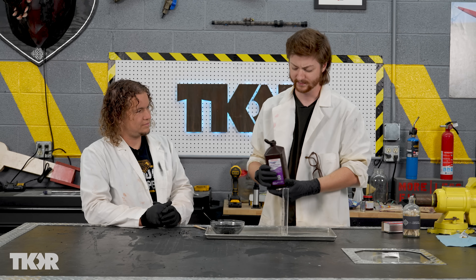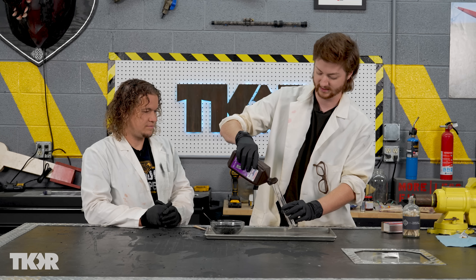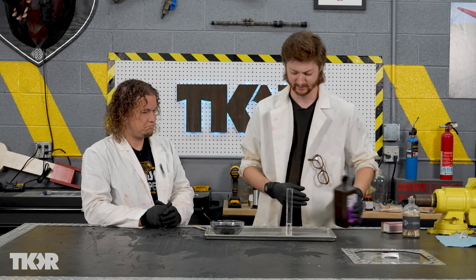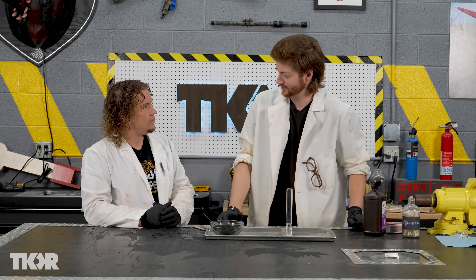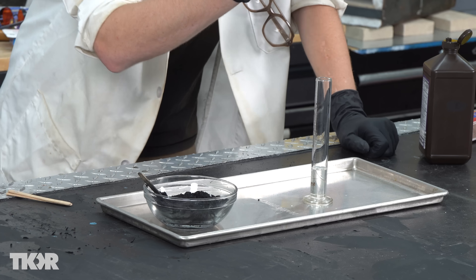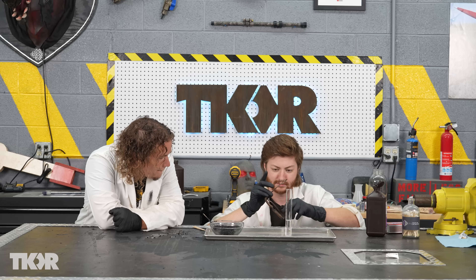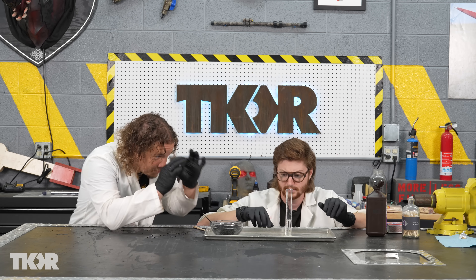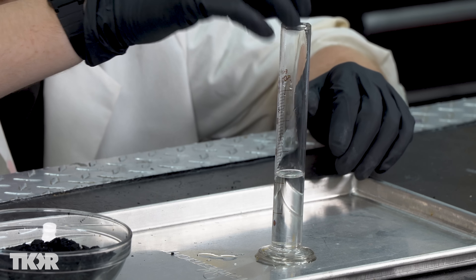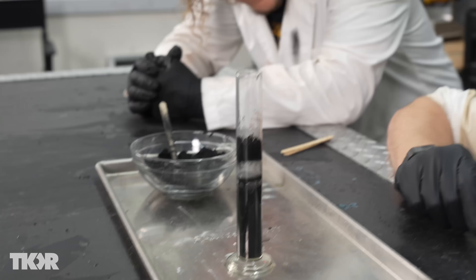Now let's do the experiment. First, let's take our hydrogen peroxide and pour some inside this graduated cylinder. Then let's just take a chunk of this manganese dioxide, drop it in, and see what happens. Got to have my PPE. And it immediately starts fizzing and bubbling — all kinds of scary black bubbles.